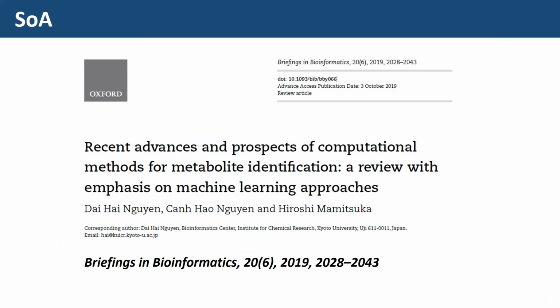And then the last question: spectra were obtained with different energies. Would it not improve the predictions, or help explain the discrepancies, maybe by looking at them separately?